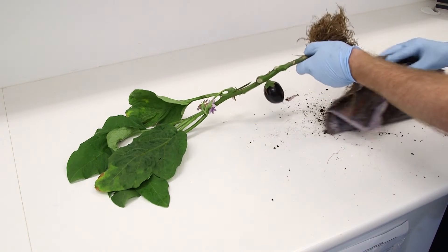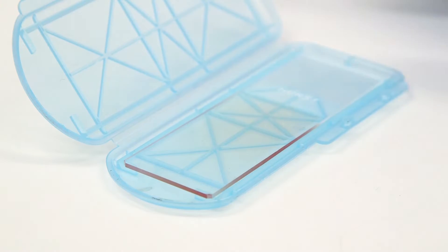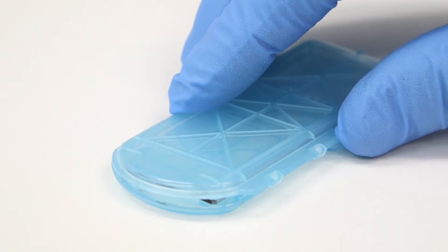For plant samples we prefer the whole plant with the roots and soil wrapped in slightly damp newspaper. We need blood smears stored in rigid slide storage cases packaged separately from any primary receptacles containing neutral buffered formalin.